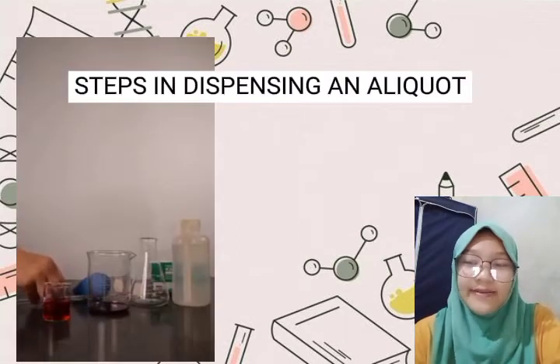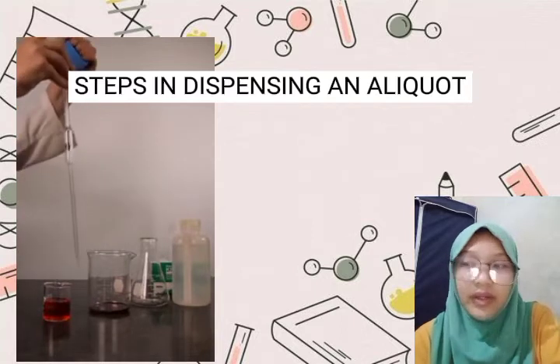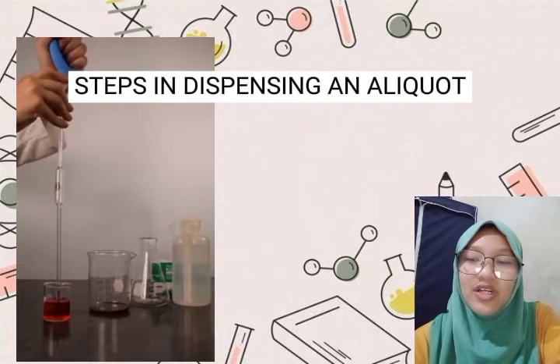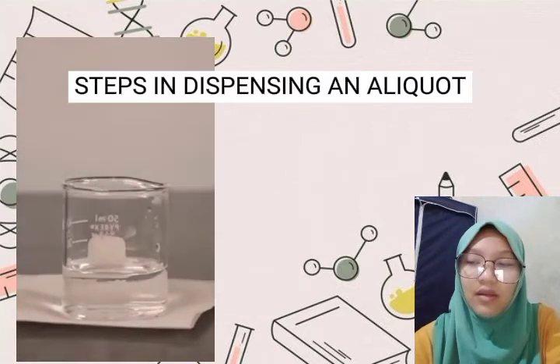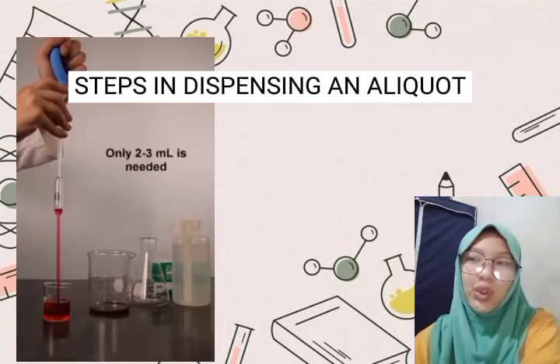So, steps in dispensing an aliquot. But first, let us define what is an aliquot. An aliquot is a portion of a larger whole, especially a sample taken for chemical analysis or other treatment. An aliquot was examined daily for the appearance of cholesterol monohydrate crystals. So, without further ado, let us continue.